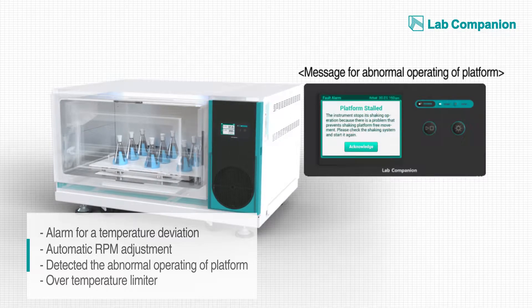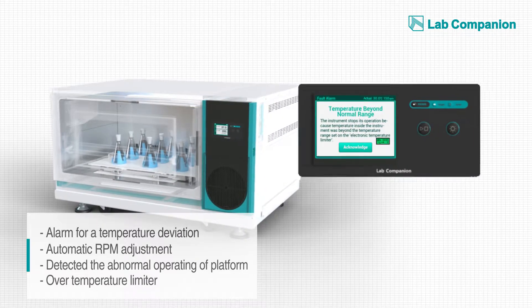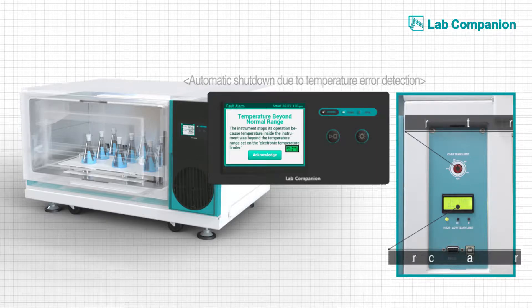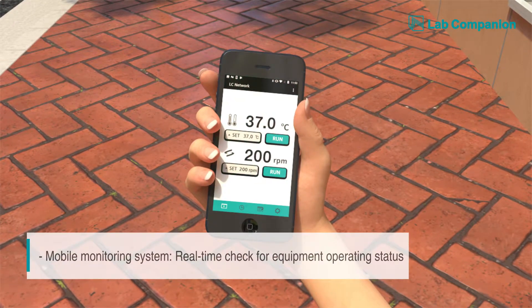Anytime the system senses abnormal conditions such as overheating and overcooling, it automatically stops the device and signals an alarm so that the safety of the sample and the device is constantly ensured. Through the state-of-the-art LC connected system, the user can monitor its operation status using a smartphone app at any time from anywhere, always connected 24-7.